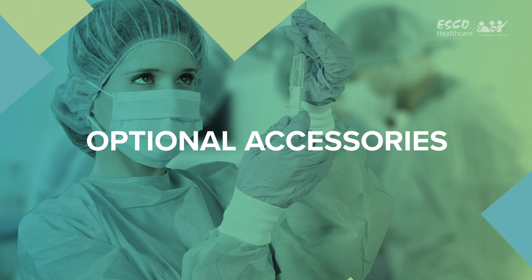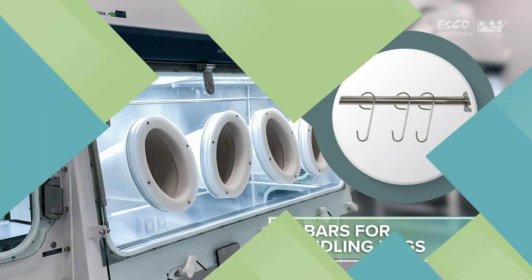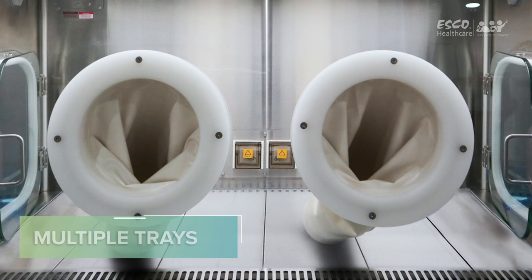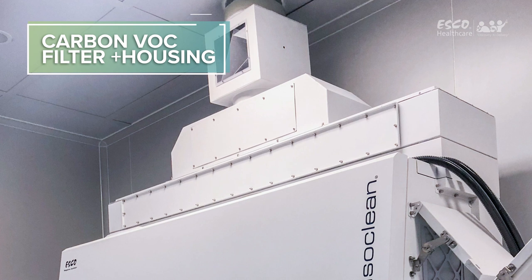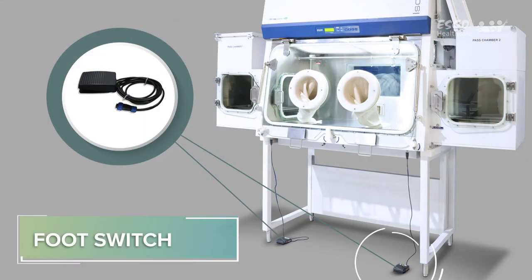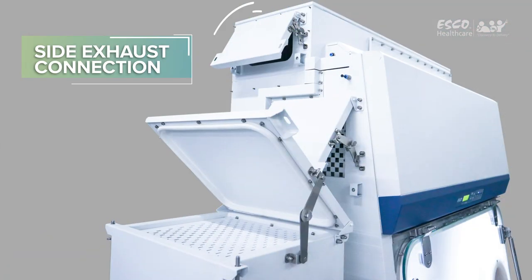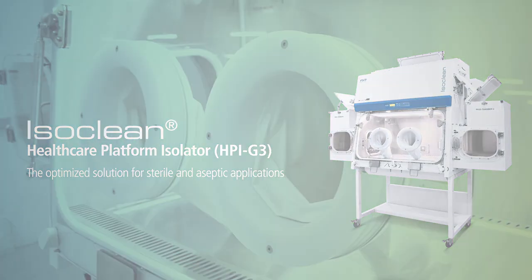Options include: CCTV, hydraulic stand, ivy bars for handling bags, glove leak tester, rear view screen, single piece multiple trays, sharps disposal, carbon VOC filter plus housing, foot switch, hard ducting, hard ducting with anti-blowback valve, and side exhaust connection. IsoClean Healthcare Platform Isolator — truly your optimized solution for sterile and aseptic applications.